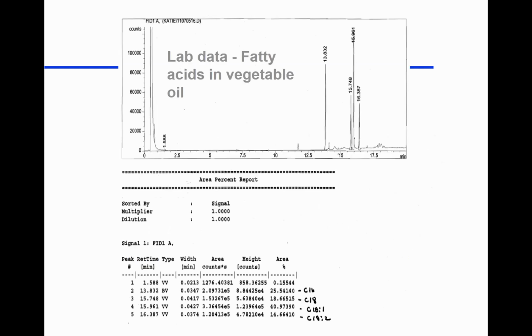And this would be typically a chromatogram from fatty acids in vegetable oil. What do you find, of course? You find palmitic acid, stearic, and then we get into the unsaturated ones. So most of them, I think, most of yours probably look like this. Probably most of you did vegetable oil. If you would have done dairy fats, you would have found the short-chain fatty acids. If you do a palm kernel or coconut oil, you would have found some intermediate size fatty acids.